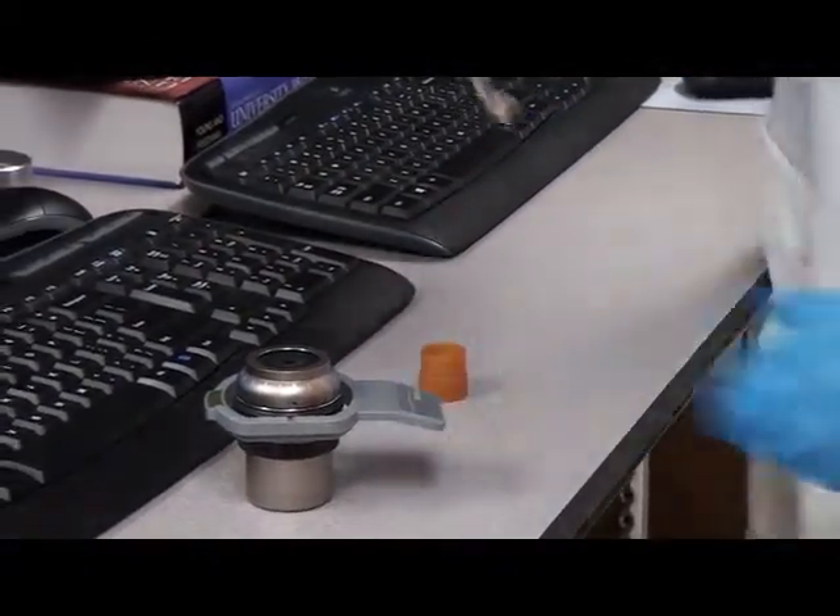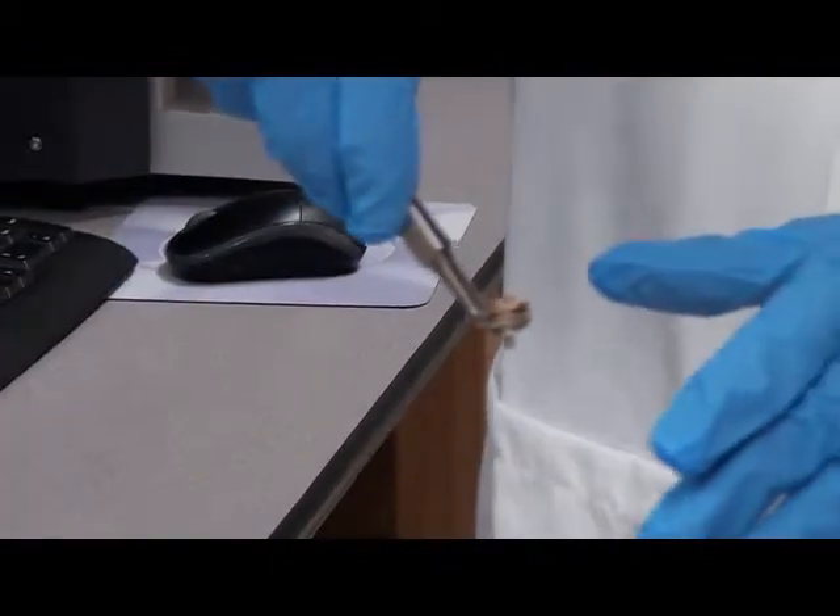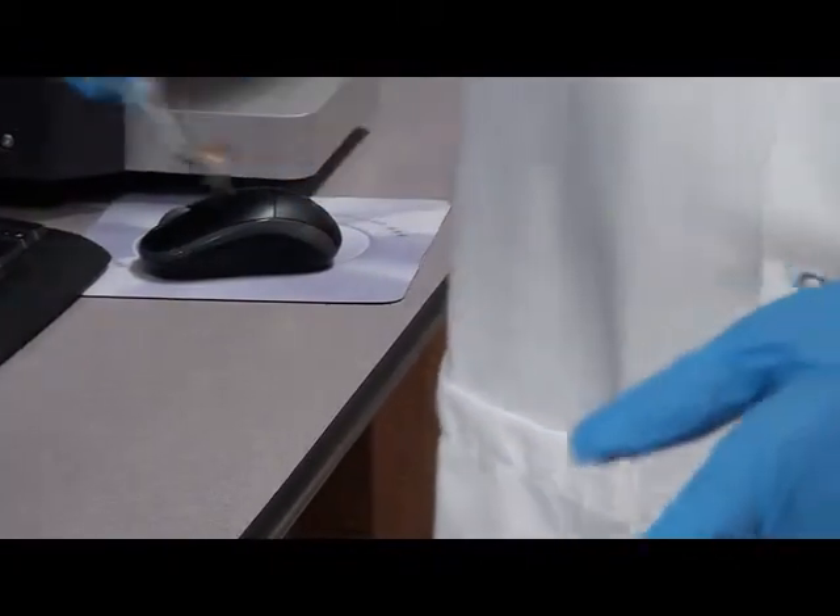If you look at this sample here, it has a coating of gold. Gold has small grains, so it gives better resolution, and it is also conductive as it is a metal.